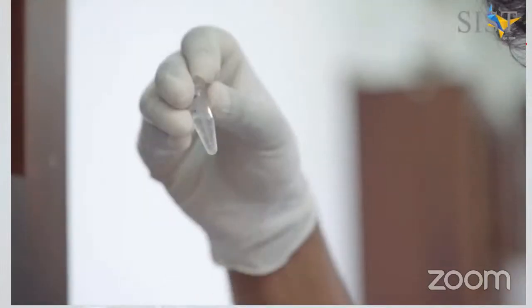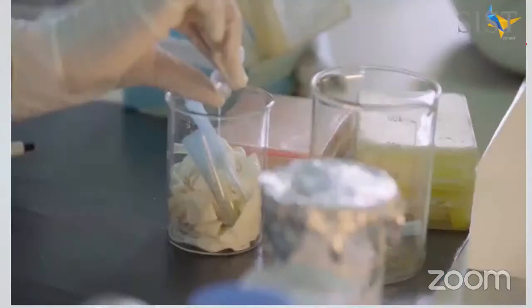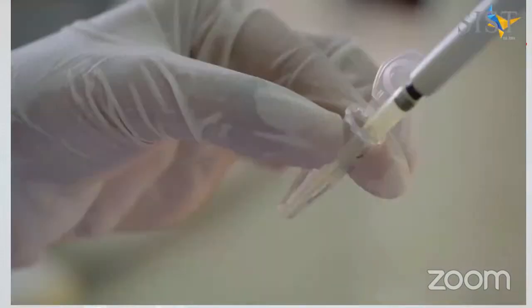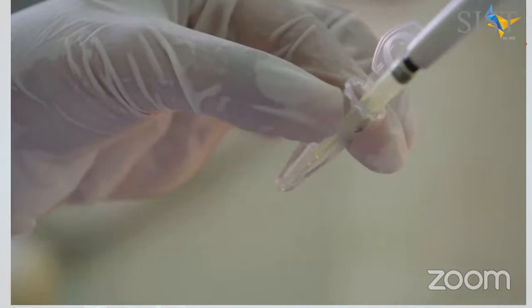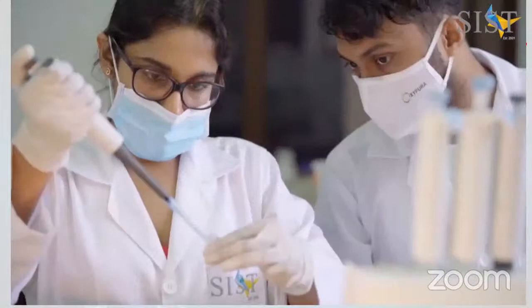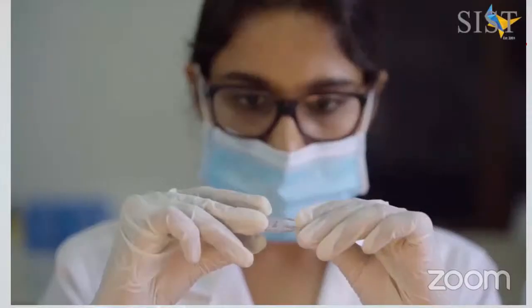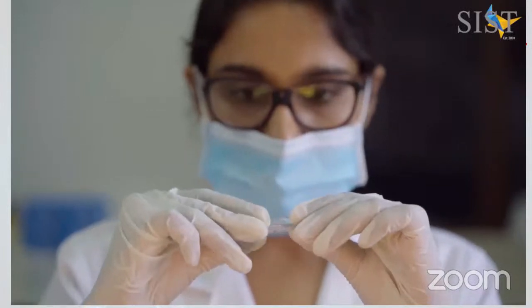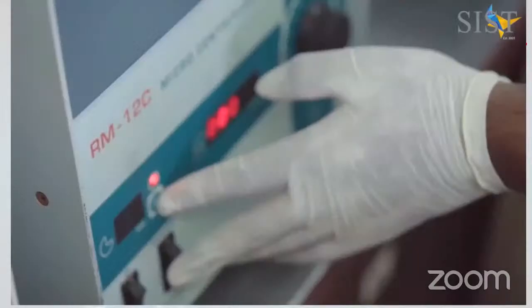The supernatant is then discarded and you add 70% ethanol in order to wash off the contents on the walls of your microcentrifuge tube. When removing the supernatant, take great care so that you do not remove your pellet. The washing step should wash all the walls so that the contents stuck on the walls come into the solution. This is again followed by a centrifugation step to obtain the final DNA precipitated pellet.